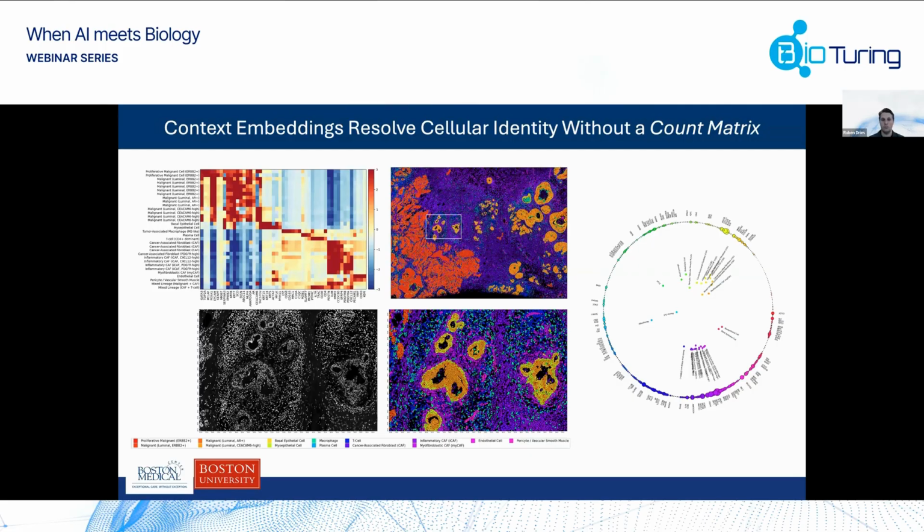But you don't necessarily have to build a count matrix. You can actually use the context embeddings, these vectors that he creates, to identify individual cell types directly from this local correlation landscape, directly from that output data. And you can clearly see, this is again the human breast cancer data set that we used previously, it is pretty good at identifying all the cell types that we did in a more classical way using Giotto Suite or any type of spatial data set.